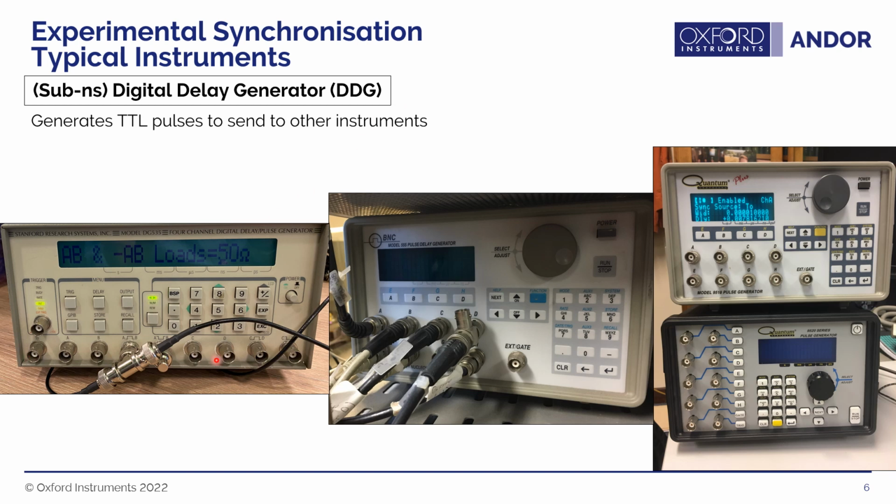You can see that they often have multiple BNC connections. Here's a variety of photos from different ones that I've used in different laboratory settings. They often have controls to determine the sequence of the timing of sending out the pulses to, say, orchestrate a variety of instruments at the same time in the lab.